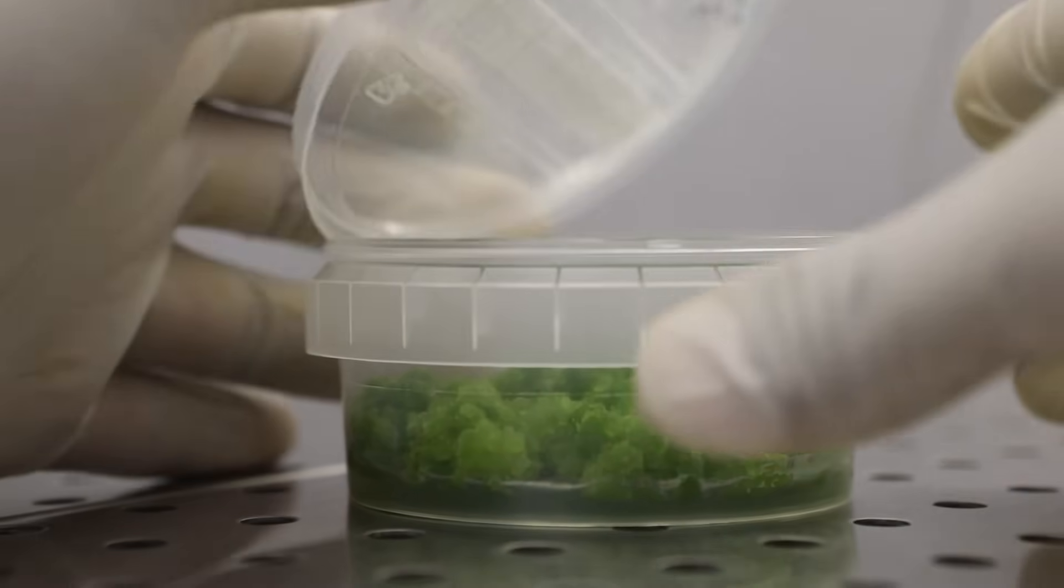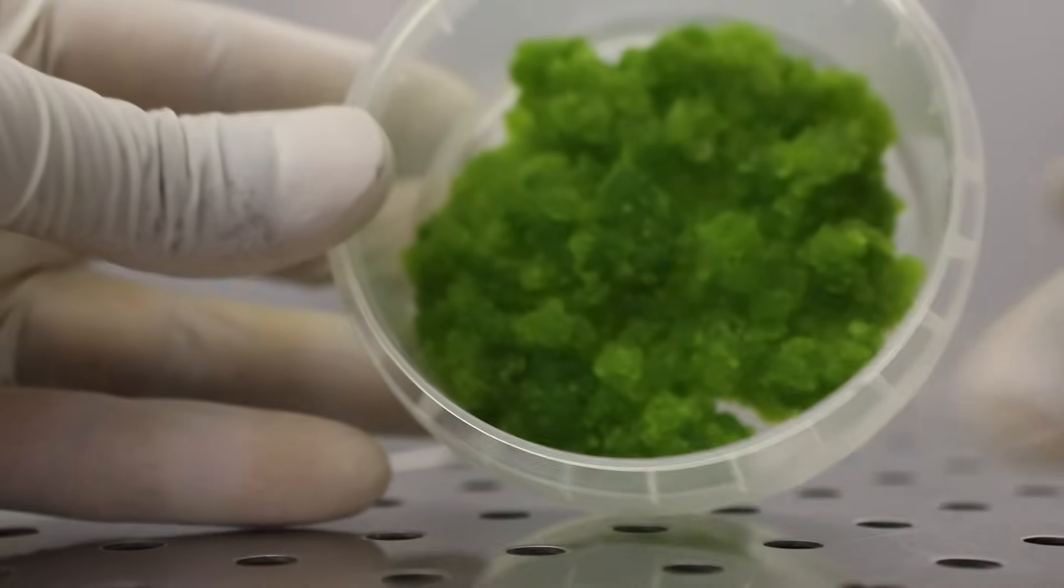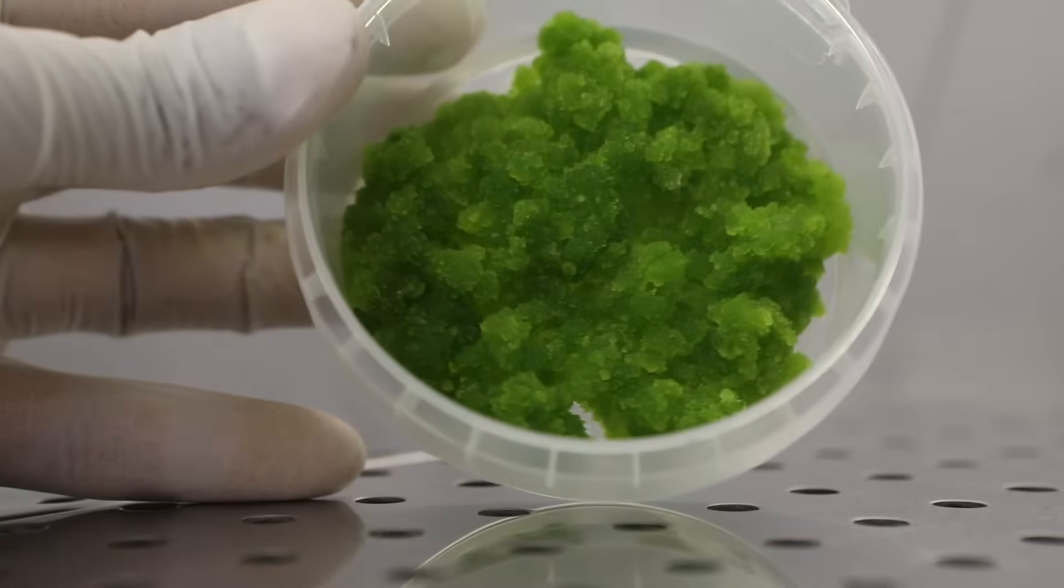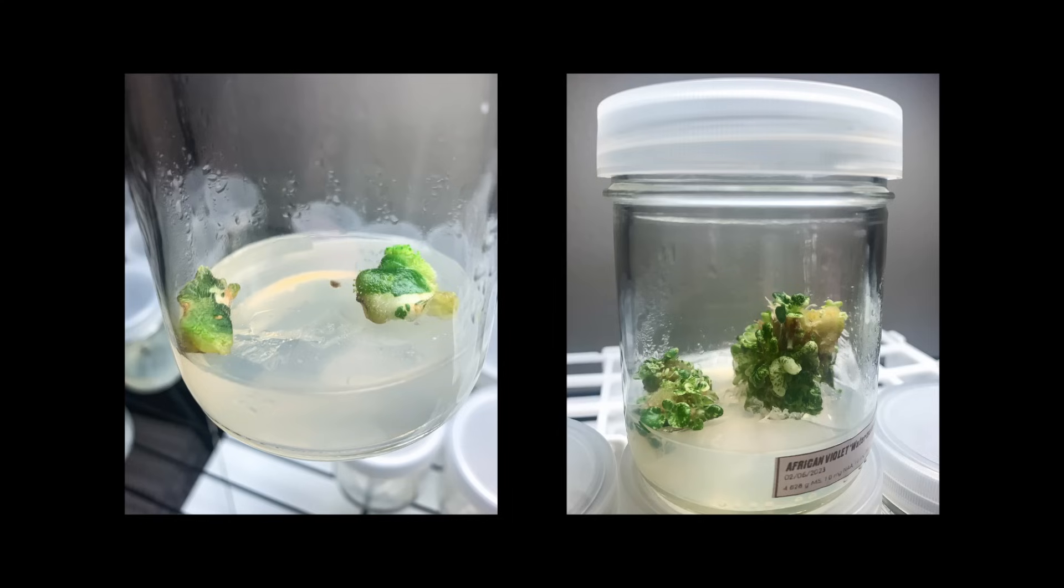When placed on multiplication media, many types of plant leaves will produce callus. From the callus, we will then see baby plants emerge, multiple baby plants per container.